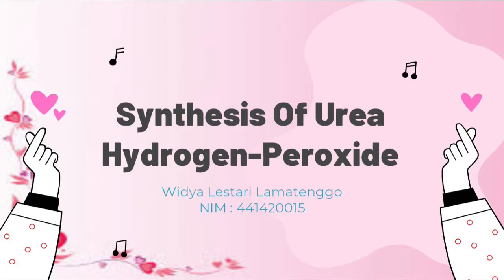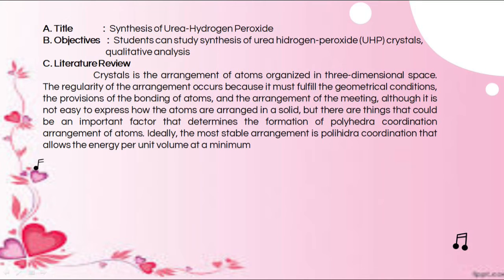In this video, I will explain Inorganic Chemistry Practicum. The practicum title is Synthesis of Urea Hydrogen Peroxide. The objective is that students can study the synthesis of urea hydrogen peroxide, or UHP, crystal and qualitative analysis.